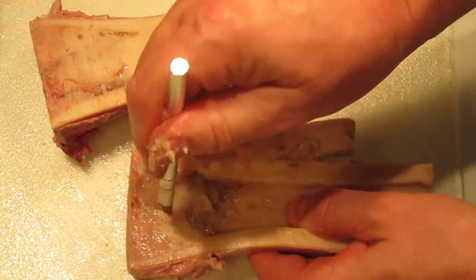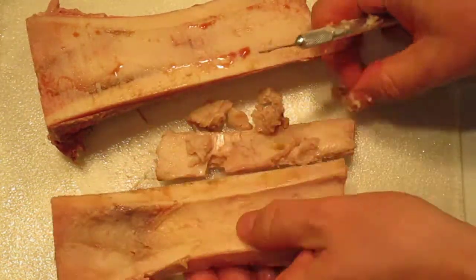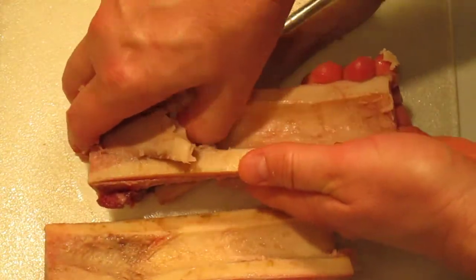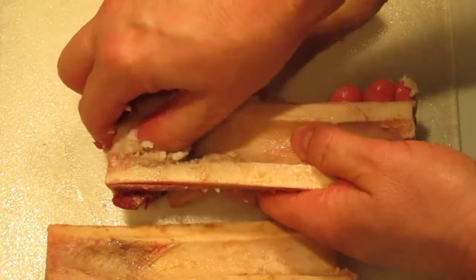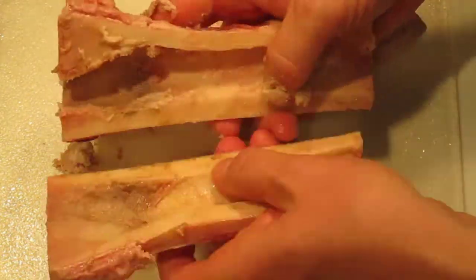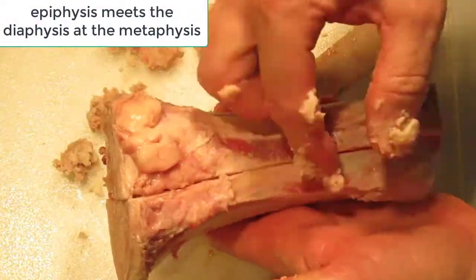This is all spongy bone here, and there is red marrow up through here — that was all the yellow marrow. Same thing on the other side. You can see the yellow marrow comes popping right out. So the epiphysis would be up here and this is the diaphysis down here — this is the metaphysis, the point where the epiphysis and the diaphysis meet.